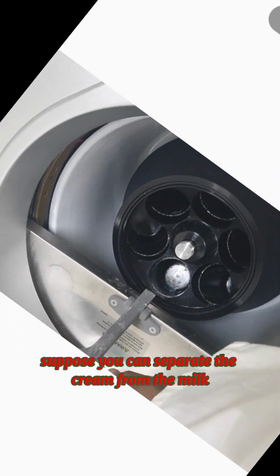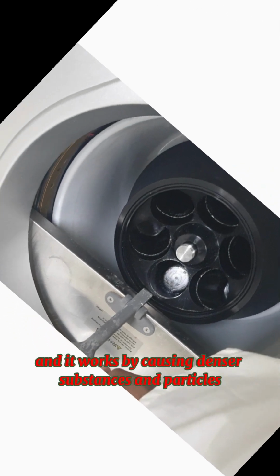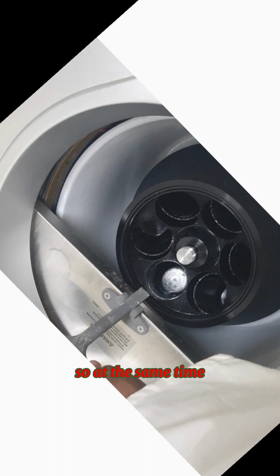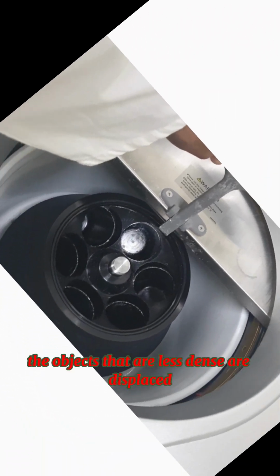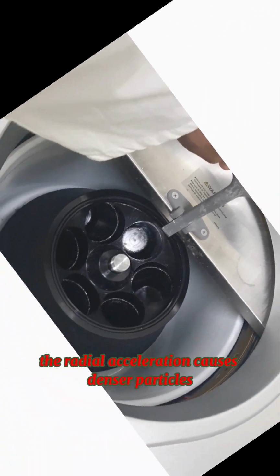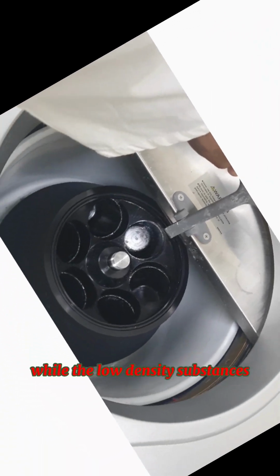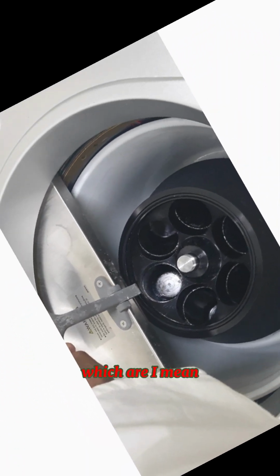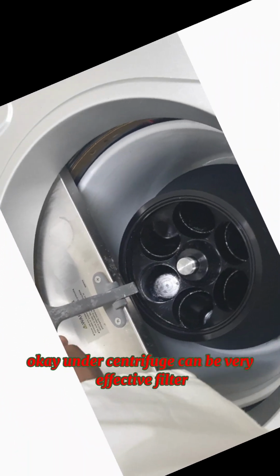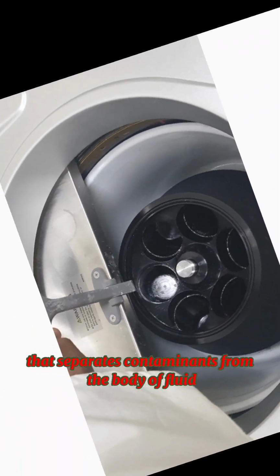Suppose you can separate the cream from the milk or liquid from the solids, and it works by causing denser substances and particles to move outward in the radial direction. At the same time, the objects that are less dense are displaced and moved to the center. In a laboratory centrifuge that uses sample tubes, the radial acceleration causes denser particles to settle to the bottom of the tube, while the low density substances, which are less heavy, will rise to the top. The centrifuge can be a very effective filter that separates contaminants from the body of fluid.